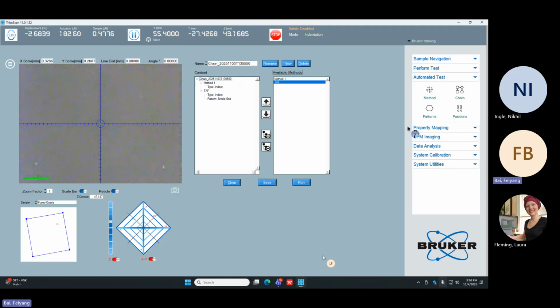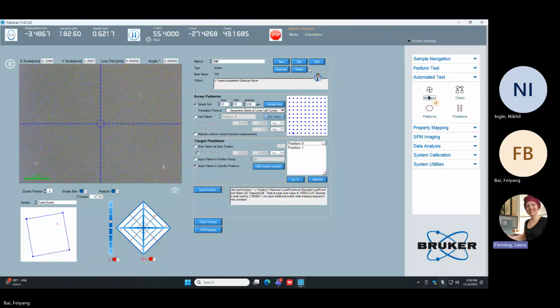And then for the method, we build it in. How do I make a different method? So go back to method. Oh, earlier I said, okay. Yep, you got it. You would go and make a new one, make the method and describe it all, and then plug it into the chain. Okay. I know it seems really obvious once you get it right, but sometimes it can take a second for it to settle in. Yep.